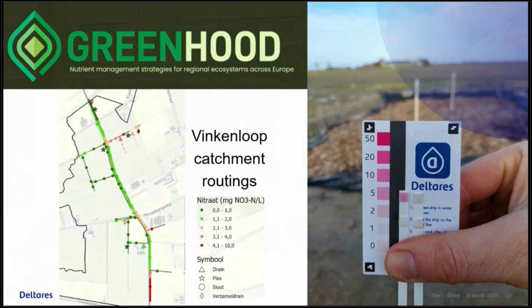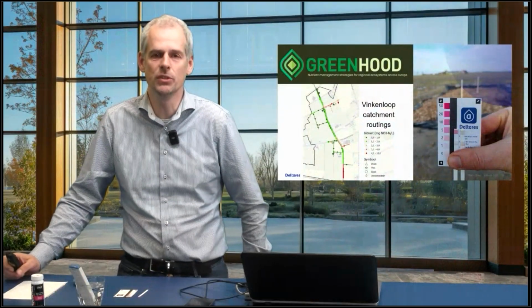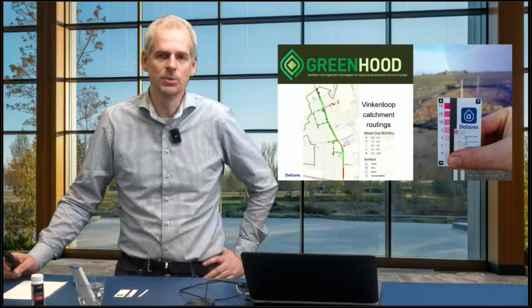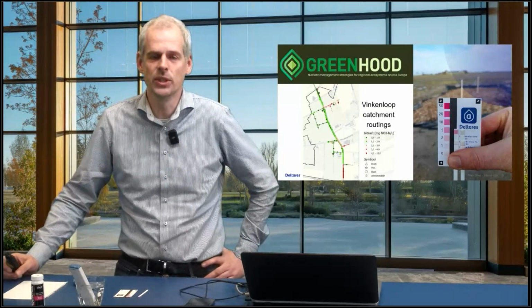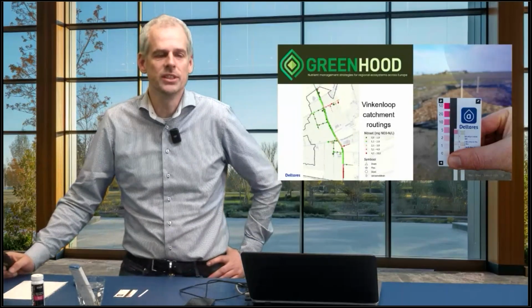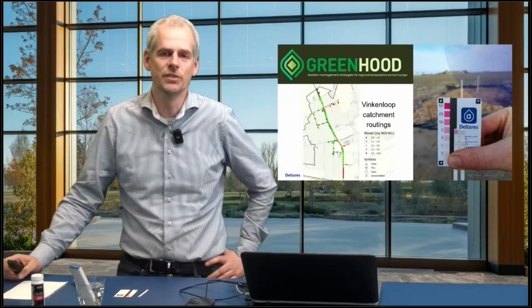We will be using the Aquality App, like the map shows here, within the research catchments to show where exactly nutrients are coming from and what route they take. This includes measurements from the stream, but also from the little side ditches and the tube drains. So you can really allocate some hotspots where you can then see if there's a solution, together with the landowner, the farmers. And if you have implemented the solution, you can also use the Aquality App to get a very instantaneous measure of the effects.